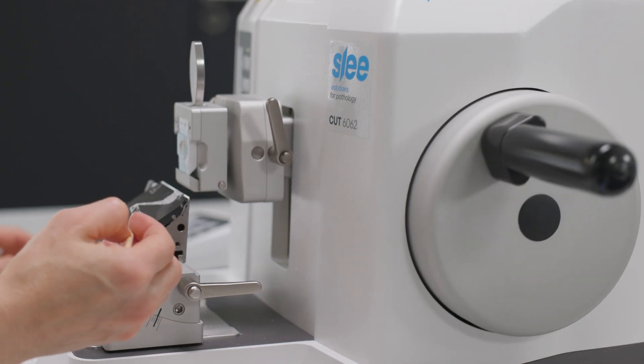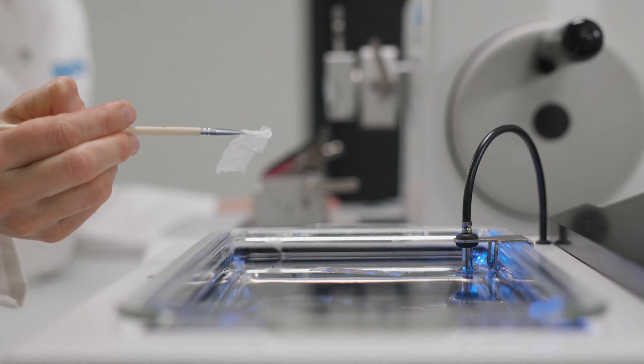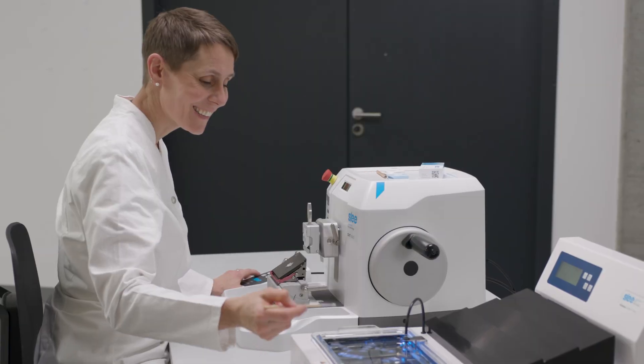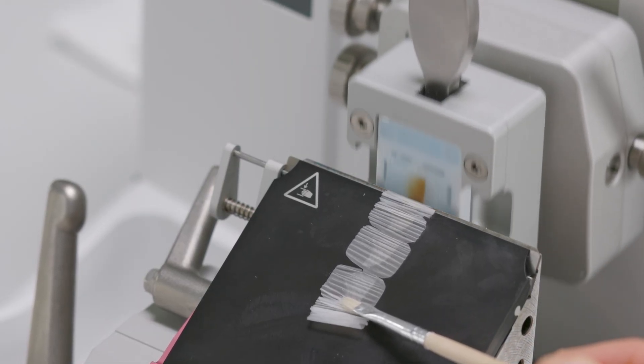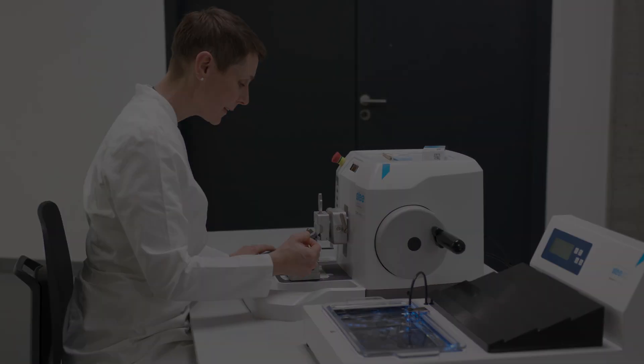Intelligent automation, maximum comfort, and safety are its hallmarks. Combining the highest precision with user-friendliness. With innovative functions and state-of-the-art German engineering, the SLEE Microtome Cut 6062.